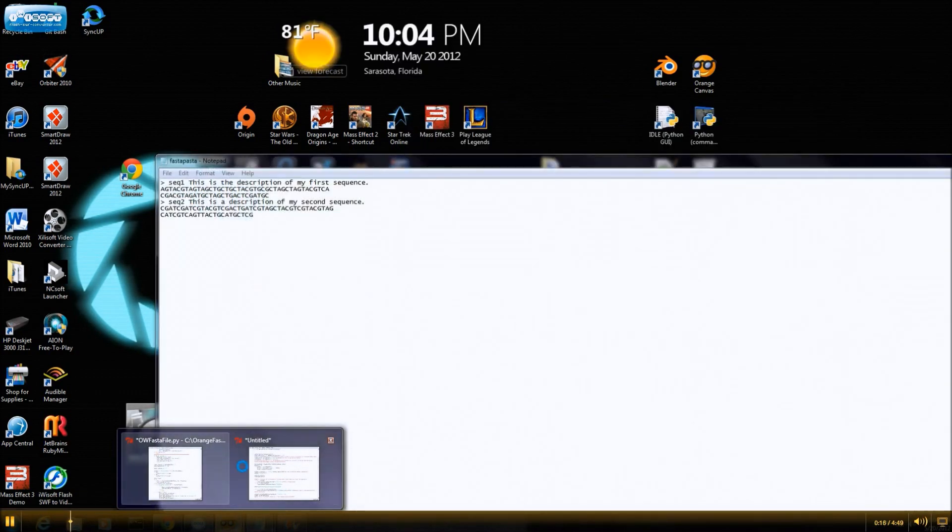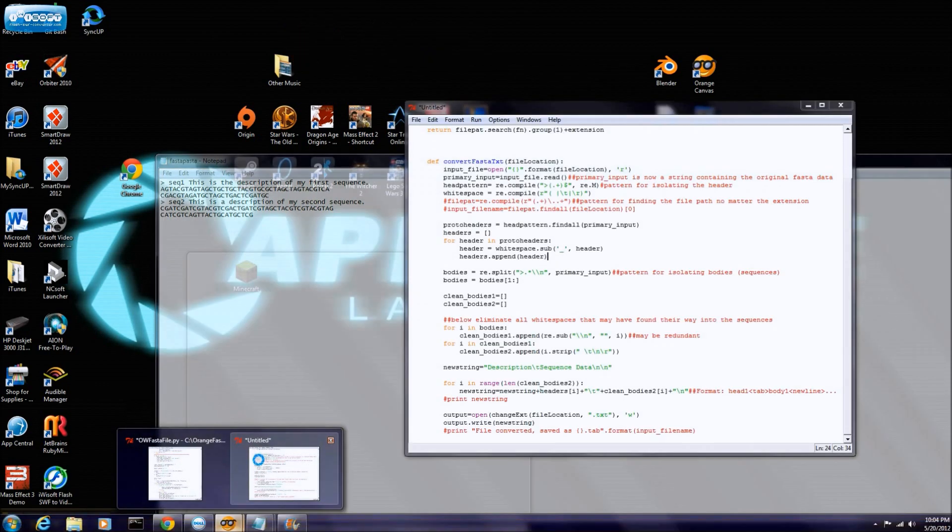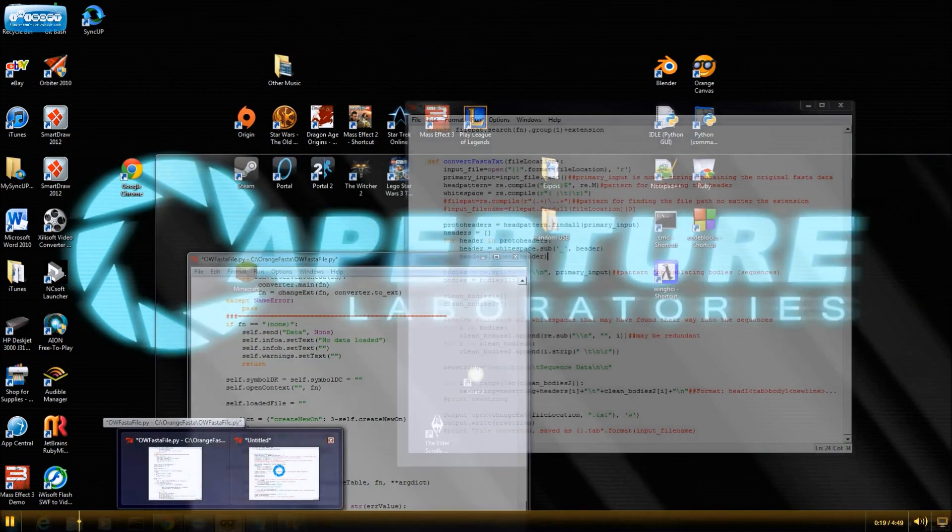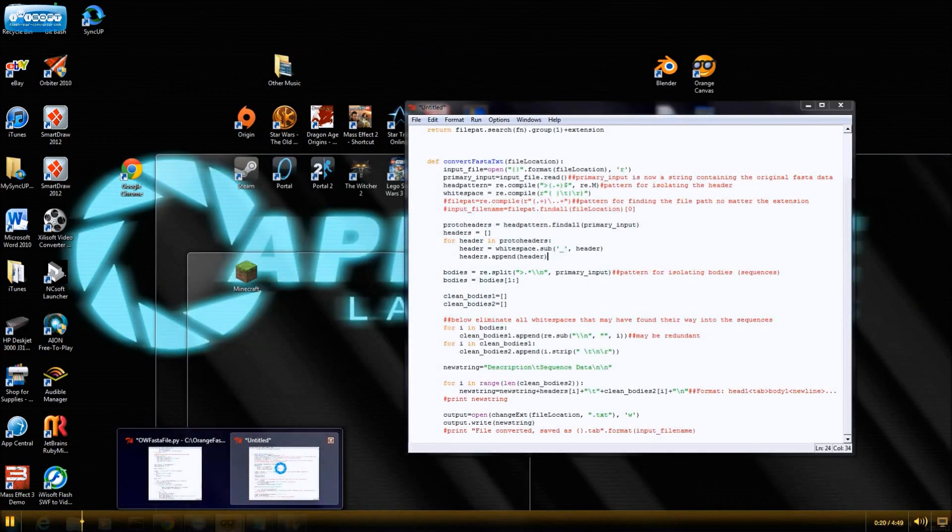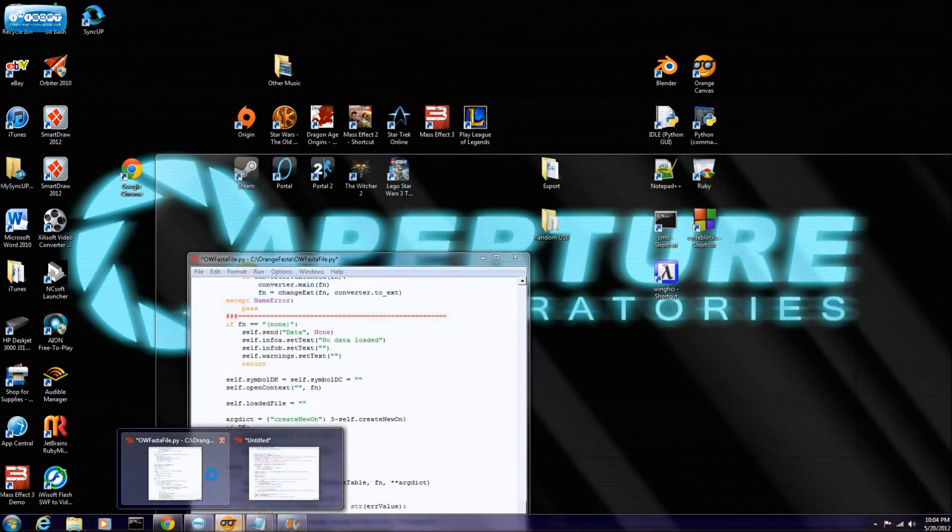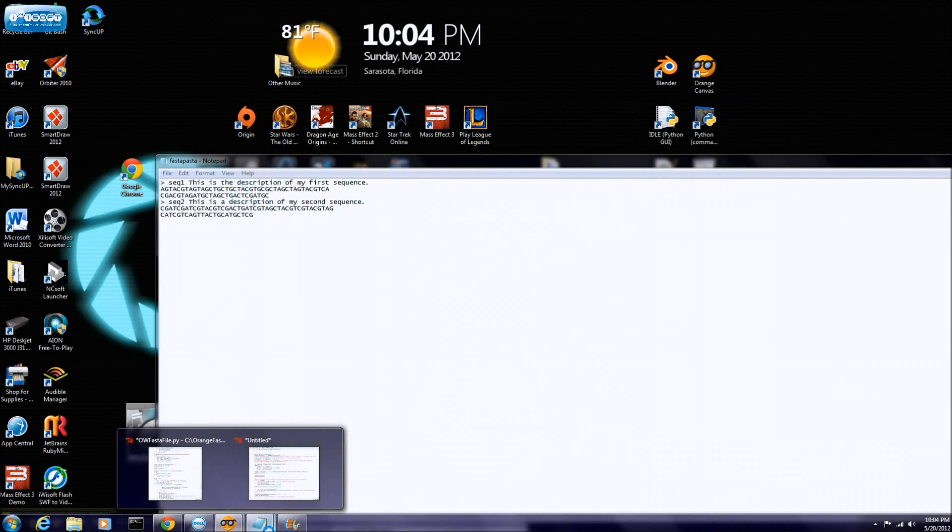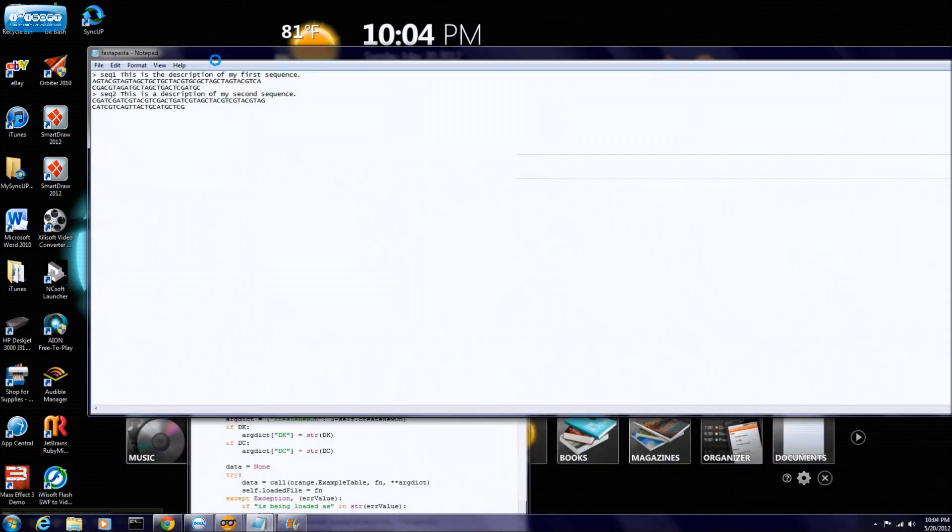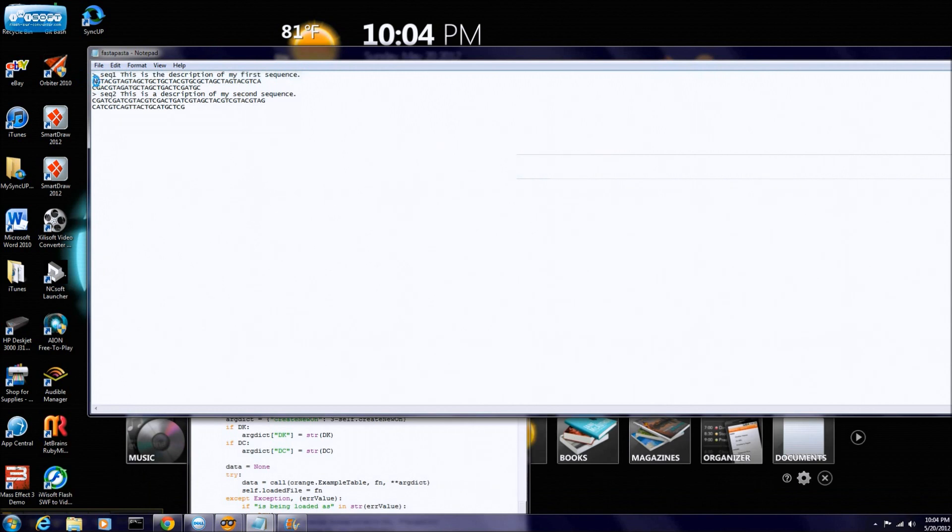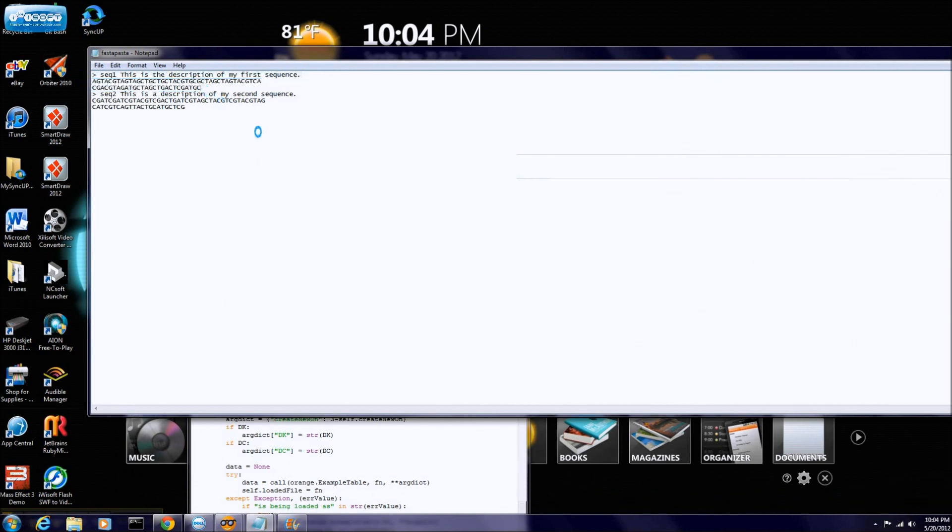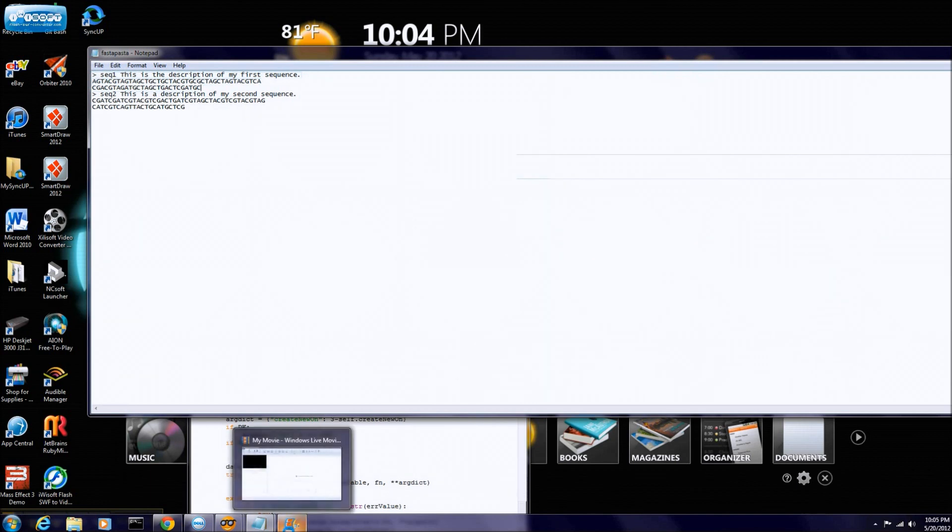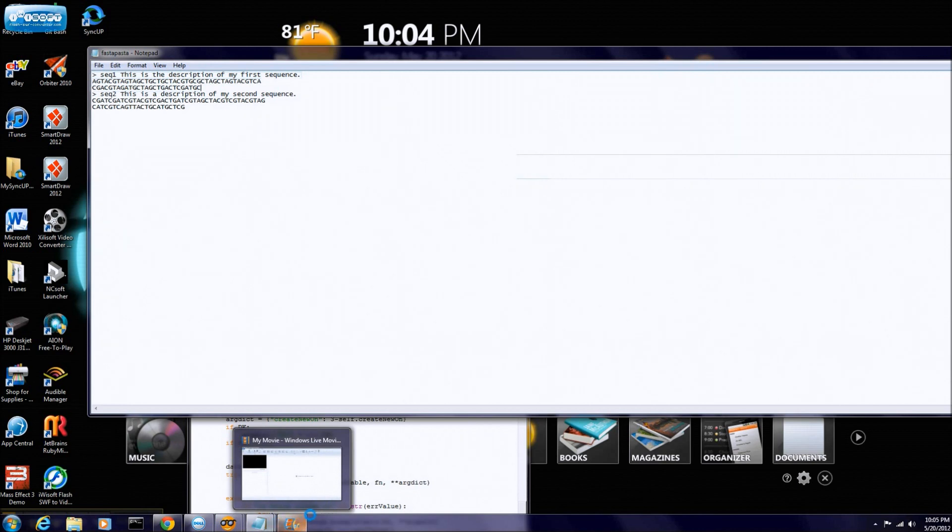So first we designed a new widget for Orange, and the main goal of this widget will be to take a FASTA file, as you can see here, header followed by sequence. And these are used for genetic data, protein data, anything that has a bunch of A's, G's, or SNPs, anything you want can be loaded into a FASTA file.